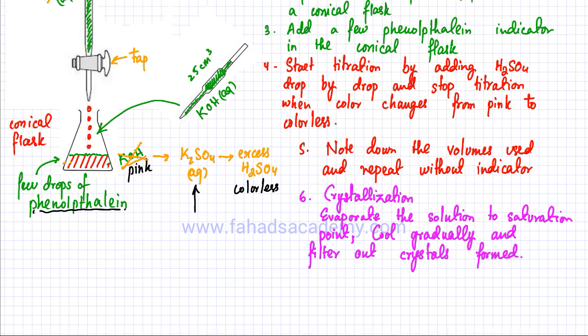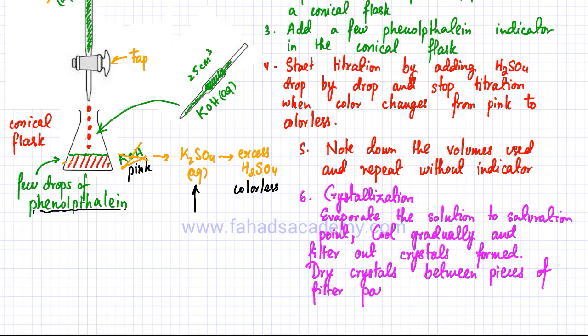And then you're supposed to dry those crystals, so dry them between pieces of filter paper. And that completes your description of this titration.